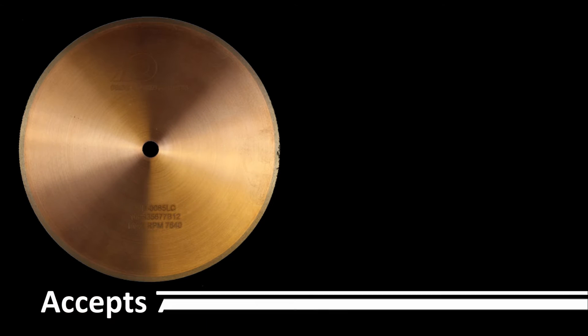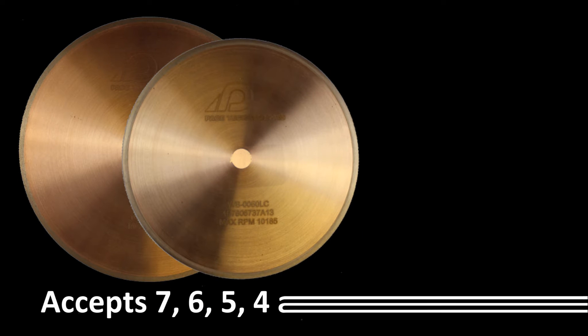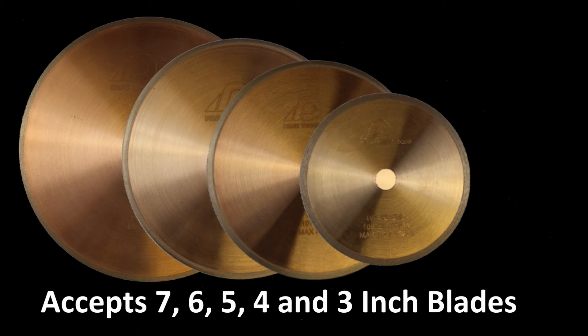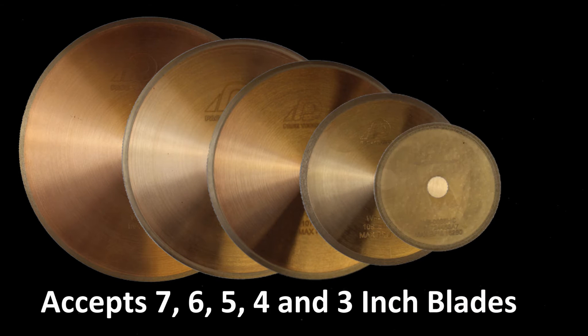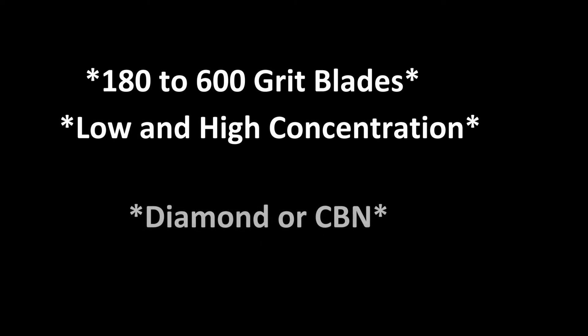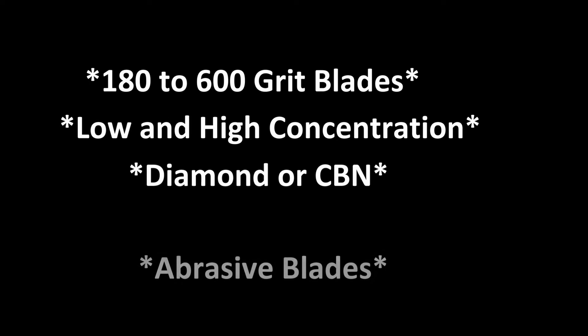The Pico 155 has been designed to accept blades ranging from 3 inches up to 7 inches. Common blades include diamond or CBN wafering blades in either a low or high abrasive concentration. Abrasive size can also be a very significant factor in the cutting result, and Pace Technologies offers both finer and coarser grit diamond wafering blades for use on the Pico 155.